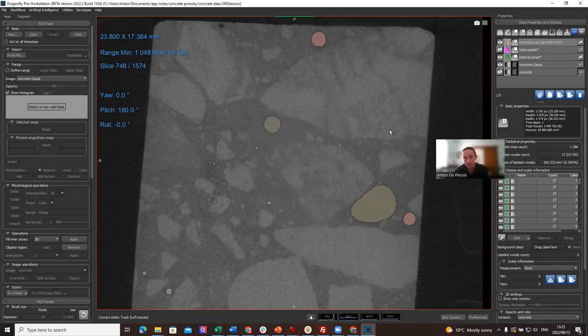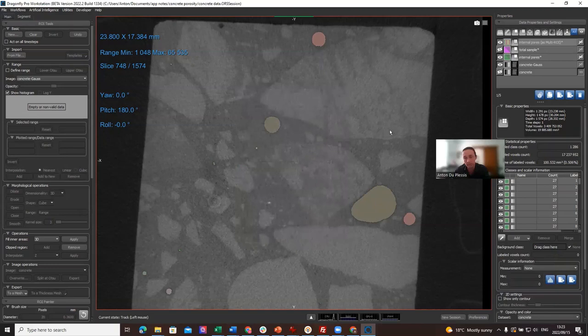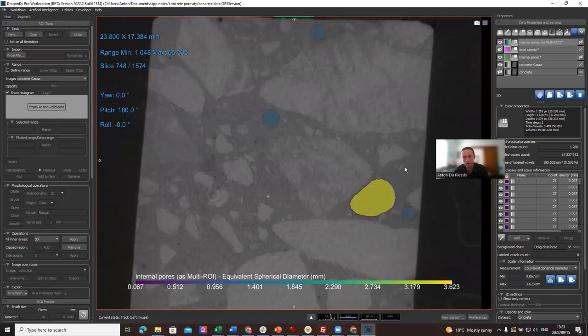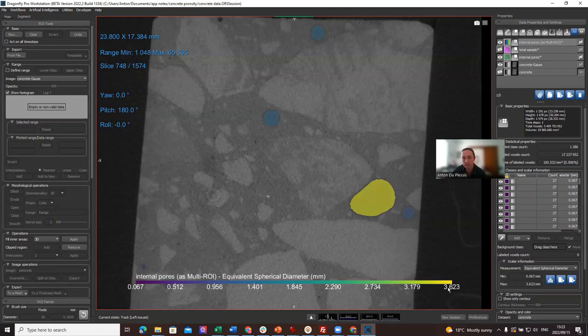Nothing is still color-coded. We need to come down at the bottom here and select, for example, Equivalent Spherical Diameter. Now we can see the pores are color-coded according to this lookup table, which is blue, purple, blue, green, and yellow. And the largest pore is yellow, and the largest pore in the volume is 3.6 millimeters in diameter.